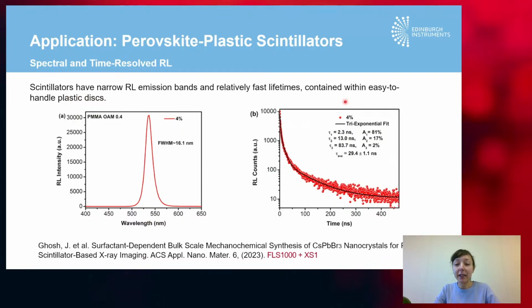The RL decay, again, had a relatively short lifetime. The average was 29 nanoseconds, again, much shorter than established commercial scintillators. So such a very responsive material gives you an advantage when you're doing time-resolved imaging.